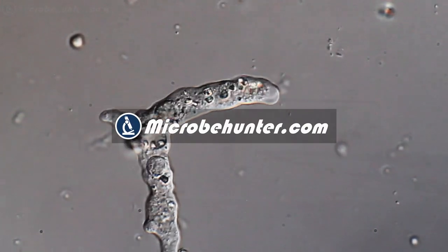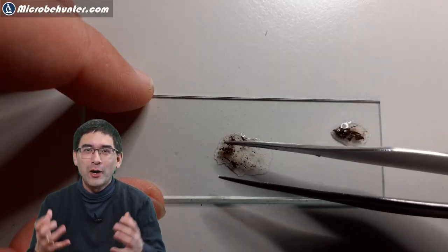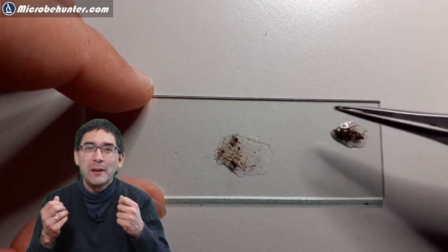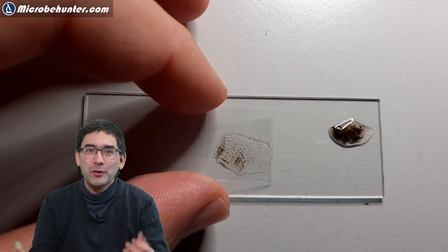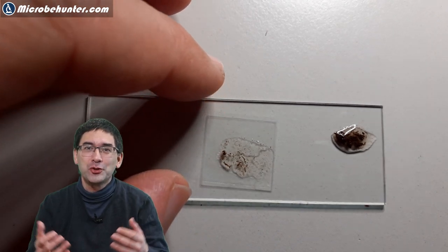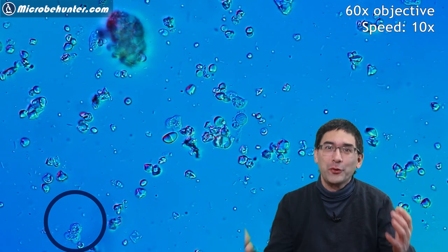So hi, MicrobeHunter here. I just recently showed you how you can extract some amoeba from decaying and rotting wood. Maybe you've already seen that video I published some time ago, but today I want to take it a level further.